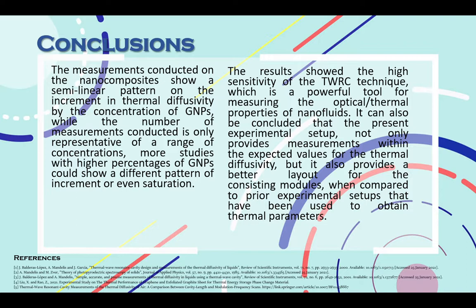The results showed the high sensitivity of the thermal wave resonant cavity technique, which is a powerful tool for measuring the optical and thermal properties of nanofluids. It can also be concluded that the present experimental setup not only provides measurements within the expected values for the thermal diffusivity, but it also provides a better layout for the constituent modules when compared to prior experimental setups that have been used to obtain thermal parameters.